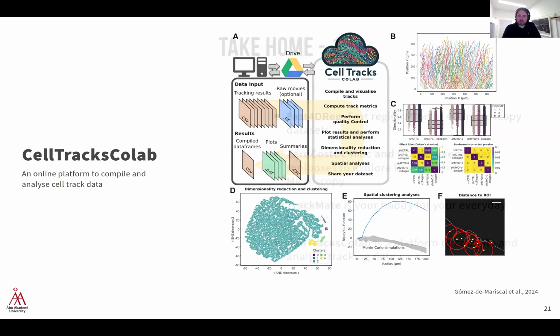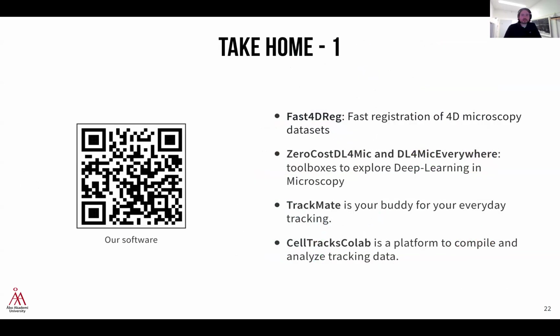Okay, so that was perhaps a slightly long first part on some of the tools that we've been working on and developing in the lab to try to solve our problems. But at the same time, I hope that some of those tools will be useful to others and perhaps to some of you.